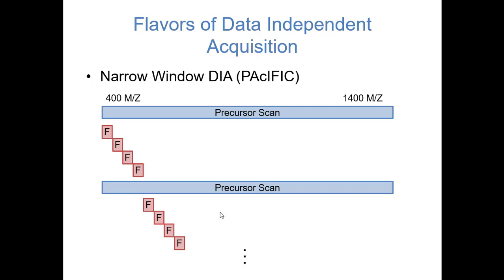Okay? So is this DIA? It is, because it's in a DIA section. Can you quantify using fragment ions using a system like this? So are you going to get repeated scans from one duty cycle to the next? No, you're not. You're shaking your head.